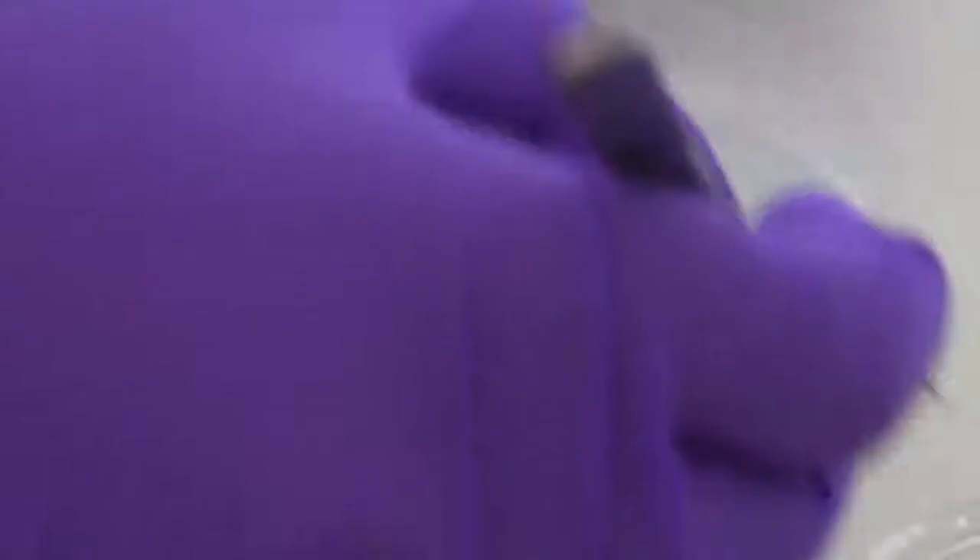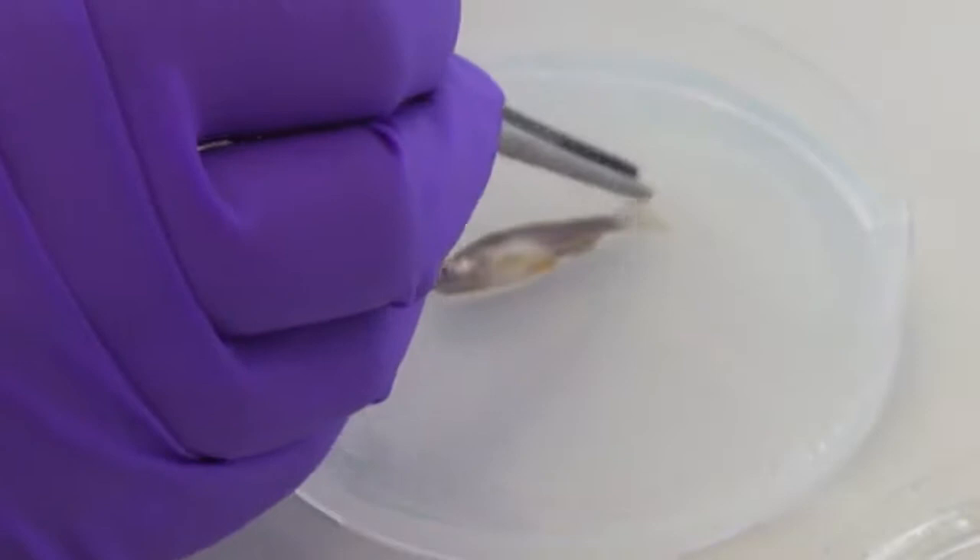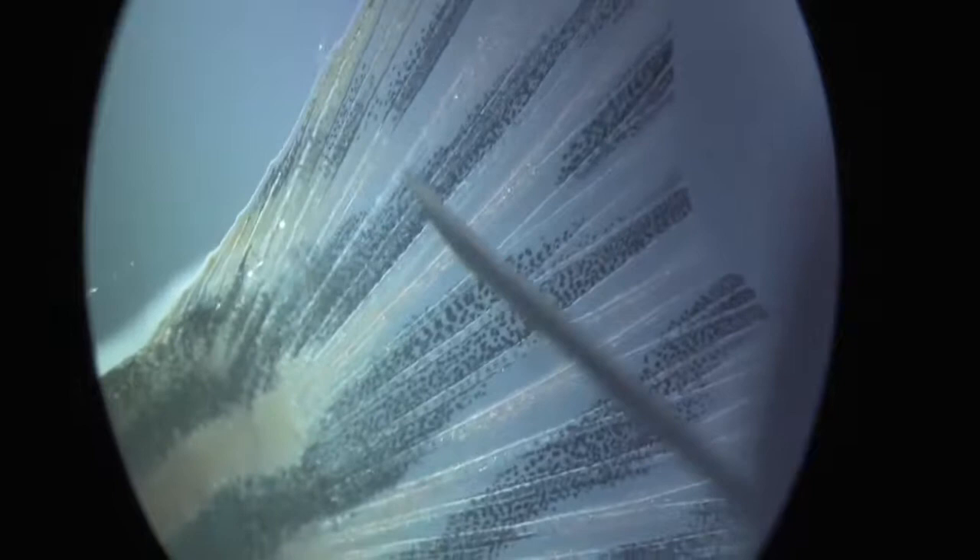To induce a fin fracture injury, place an anesthetized zebrafish on its lateral side in a 100mm agarose-coated petri dish under a dissecting microscope, and push an injection needle slightly into a bony fin ray segment until a crack appears.